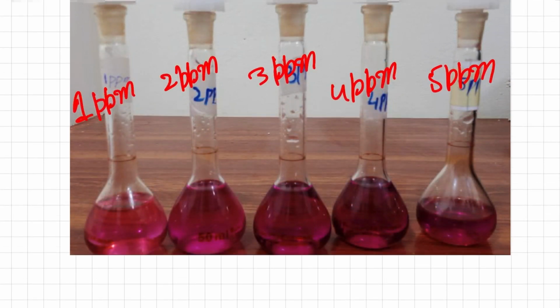What will you do if your unknown concentration lies below the detection limit of the instrument? For example, say the detection limit of this HALO DB-20 UV-Visible Spectrophotometer is 1 ppm, so it never measures any concentration below 1 ppm, and your unknown solution is more dilute than this. Then what will you do? In that case, you will perform the standard addition method, also called the pre-concentration method.